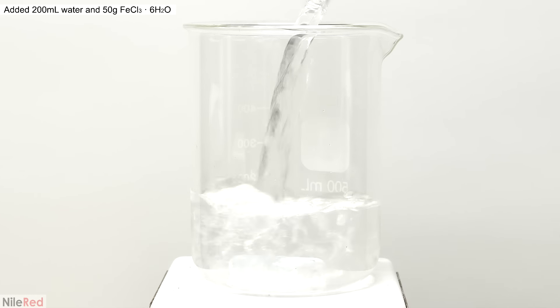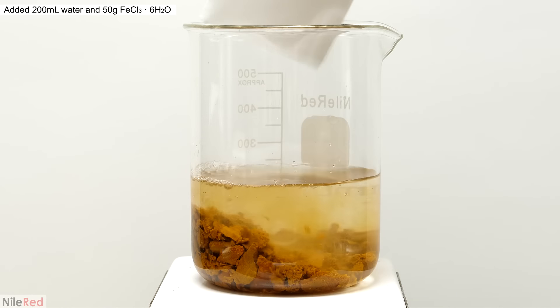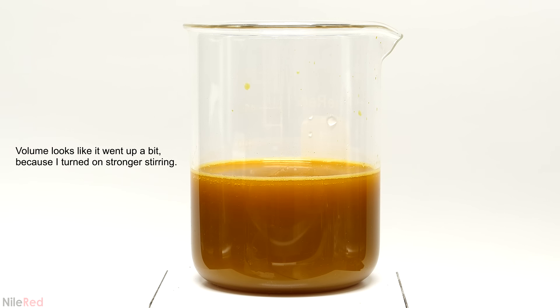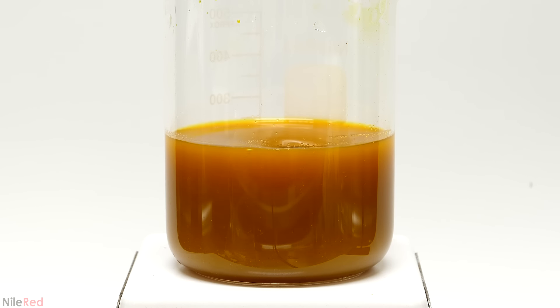For the moment, I put it on the side and I moved on to making the next solution. I poured in two hundred mils of water and added fifty grams of the iron chloride. Then I turned on the stirring and waited for it all to dissolve. About twenty minutes later, there was still a bunch of solid stuff floating around, but it wasn't really worth filtering it.